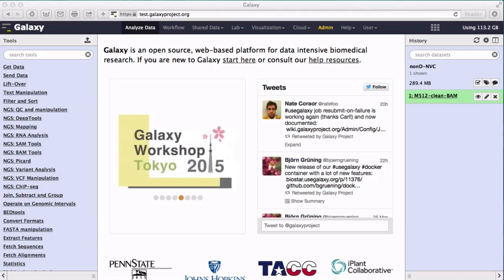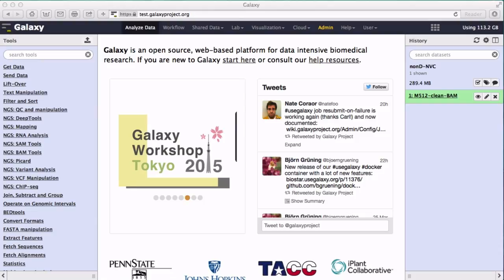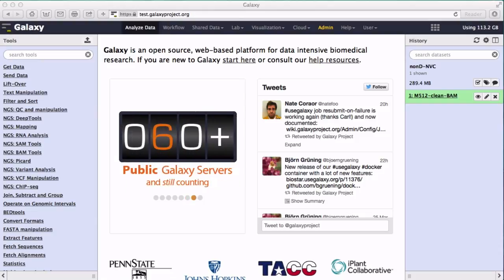In this example, we will analyze variants in the mitochondrial genome, which is a non-diploid mixture of actually multiple genomes, and so this is also applicable to the analysis of variation in viral, bacterial, and other organellar genomes. In all those cases, you expect continuous allele frequency anywhere between 0 and 1, or 0 and 100%.